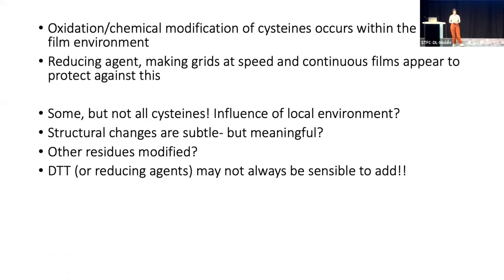Again, I'm just going to come back to that. Adding a reducing agent, particularly DTT, may have other implications in terms of your structure determination. So if you're going to try it, try with caution, I would say. And then the final thing on this one is just a little bit of a plea.